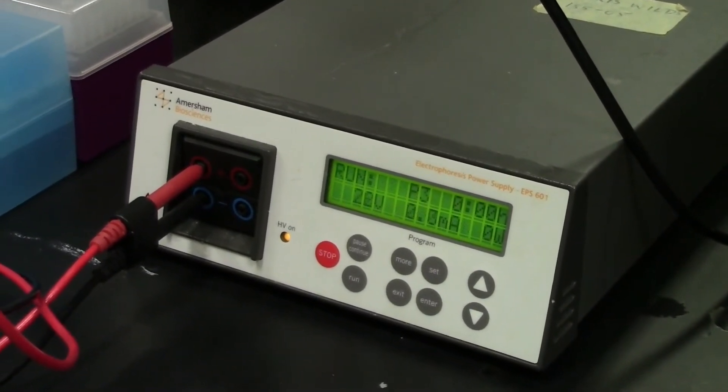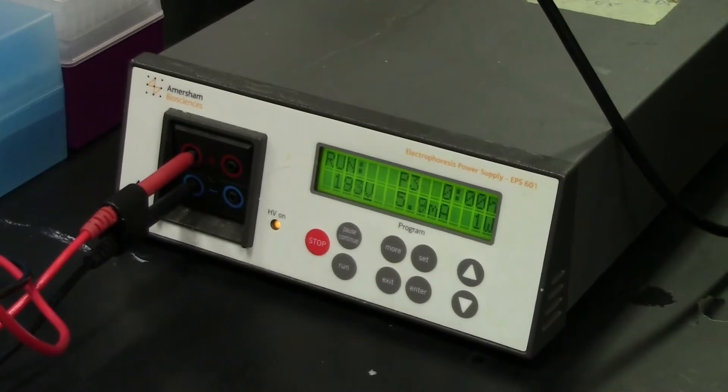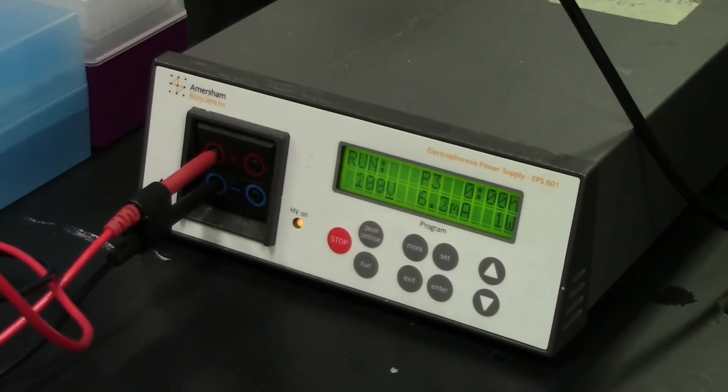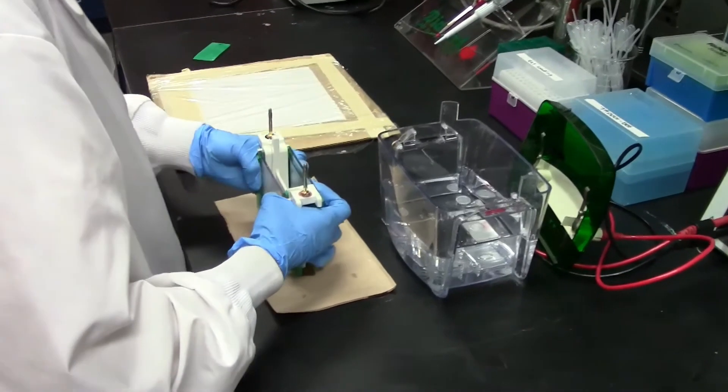Although dependent on your samples, we typically run the gel until the dye band is about three quarters of the way through the gel because our oligos vary from 5 to 30 nucleotides.